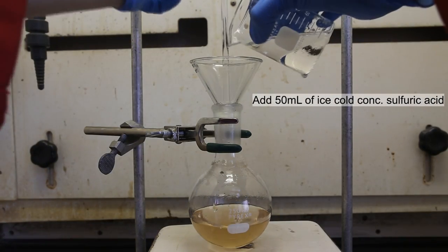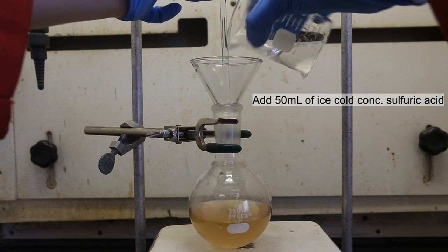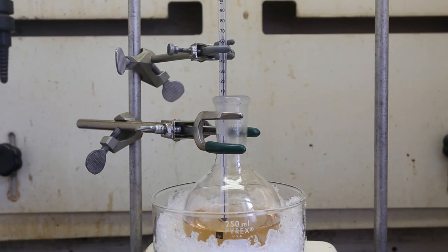Wait for the reaction to cool to about 40 degrees Celsius, and then add about 50 milliliters of ice-cold concentrated sulfuric acid. Be sure to add the sulfuric acid slowly. Once all the sulfuric acid has been added, place the round bottom flask into an ice bath. Also, at this point, you should put in place a thermometer. It should be noted that even after the addition of the sulfuric acid, the solution never got hotter than about 65 degrees Celsius. You should make an effort to never let the solution get hotter than 65 degrees Celsius.